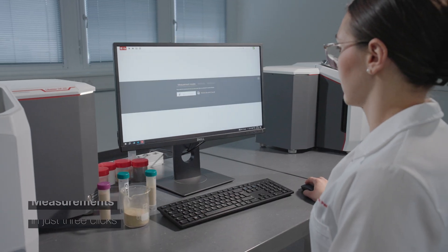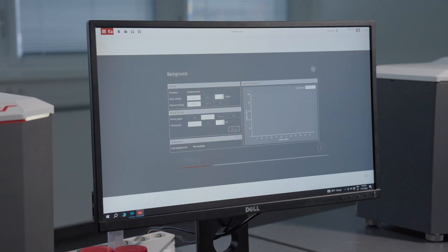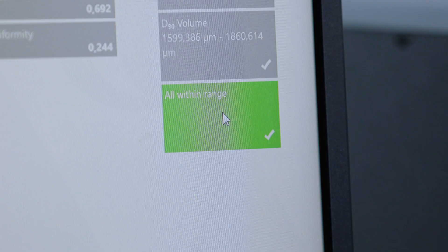You can't go wrong with the Calliope software. Measure in just three clicks — no software training required. A dedicated QC mode ensures parameter settings are always correct and applies clear pass/fail criteria to samples.